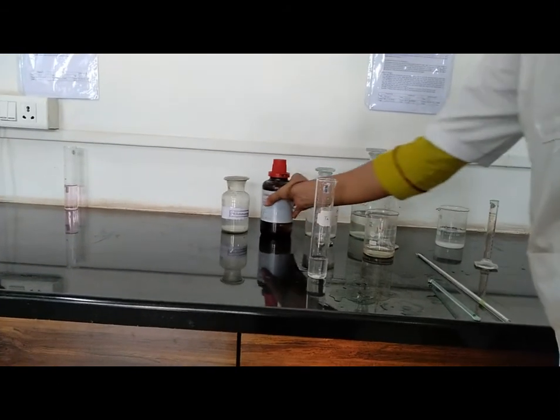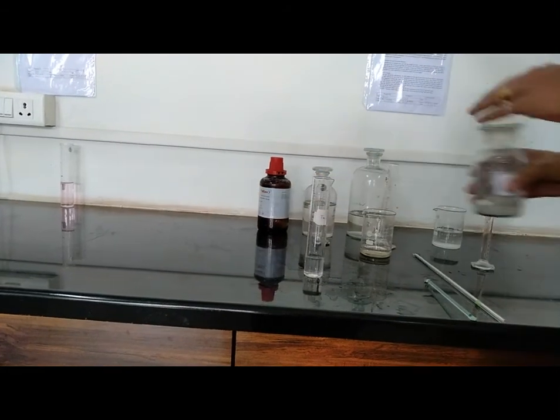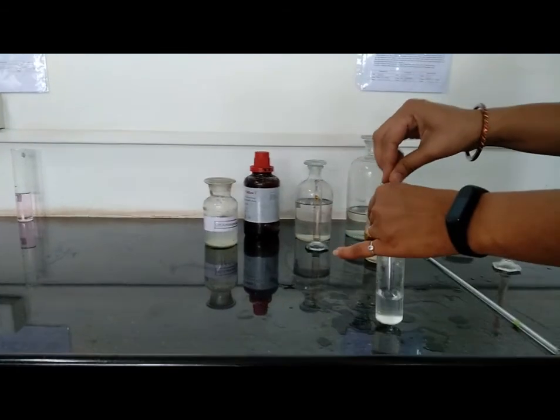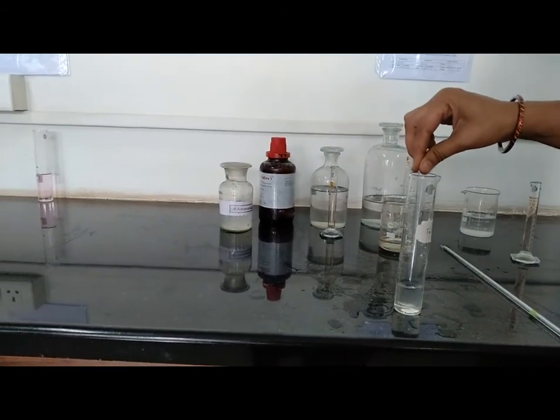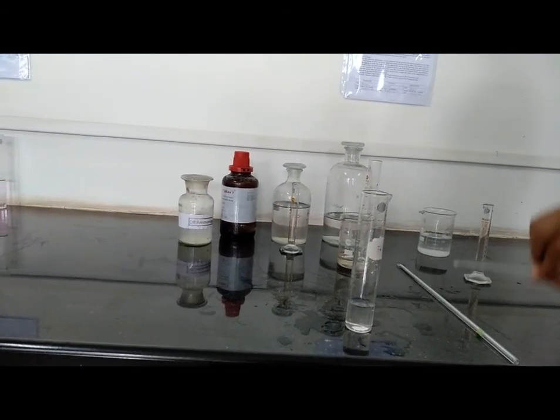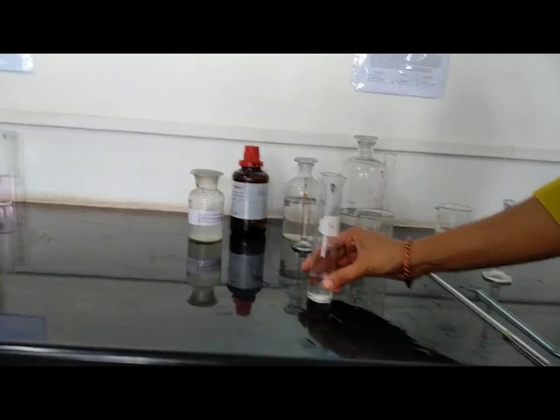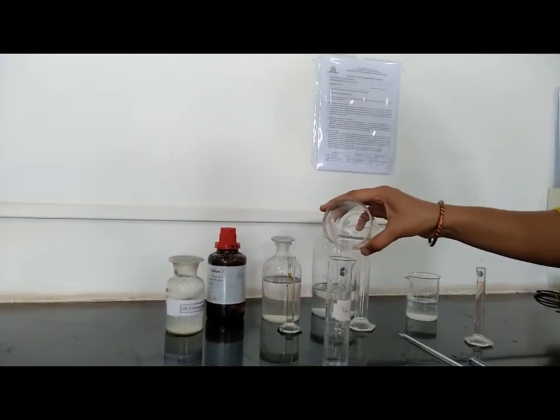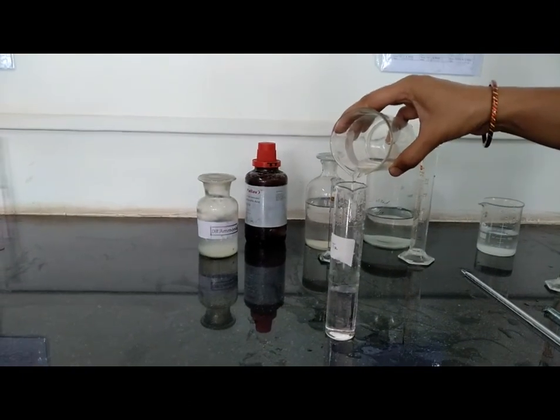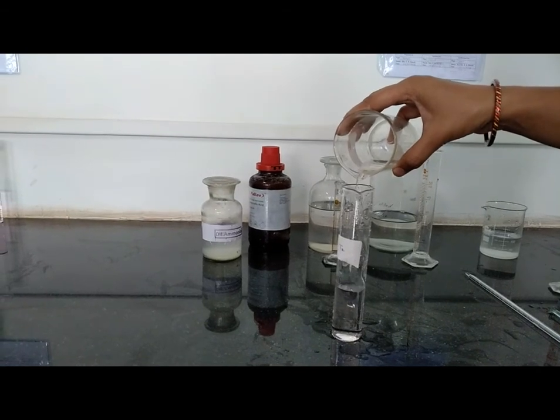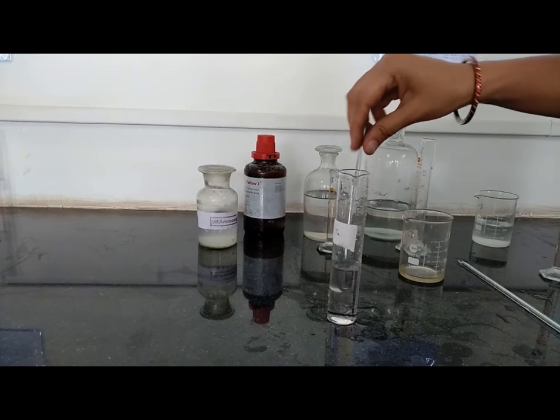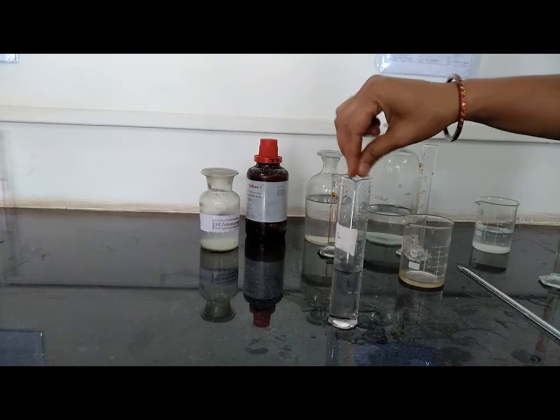Add 0.1 ml of thioglycolic acid. Add ammonia solution to make it alkaline. Mix with glass rod. And dilute it up to 50 ml with distilled water.